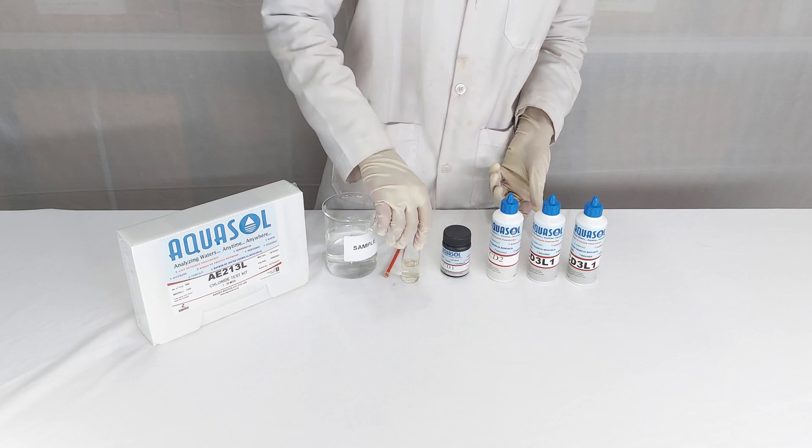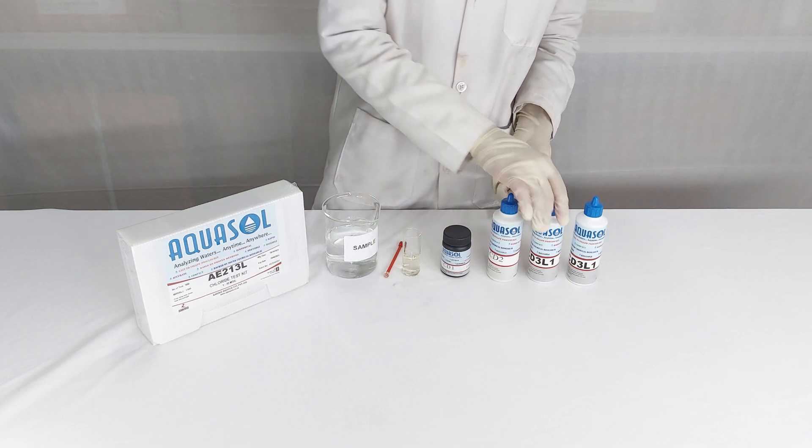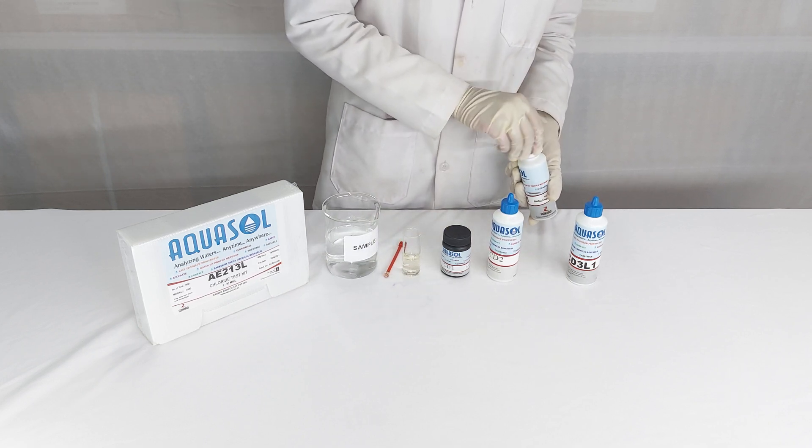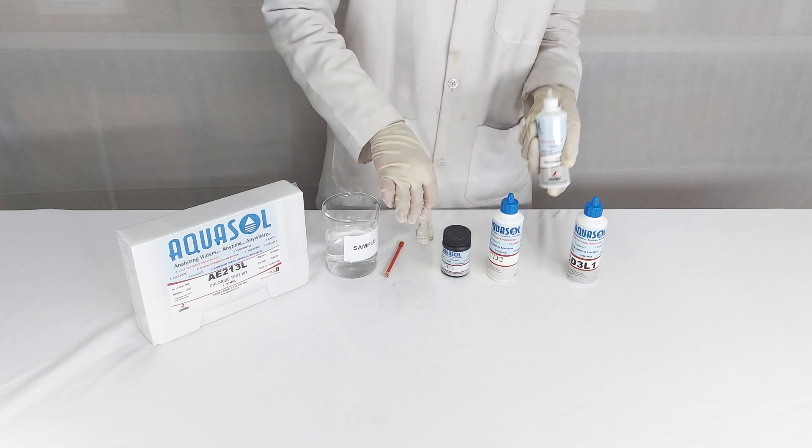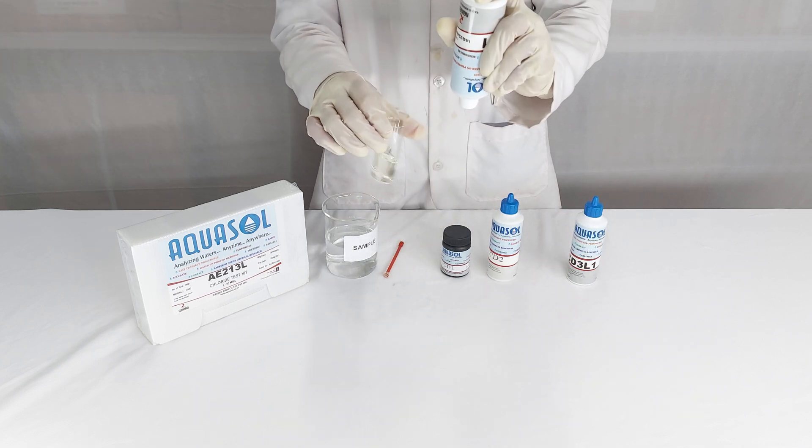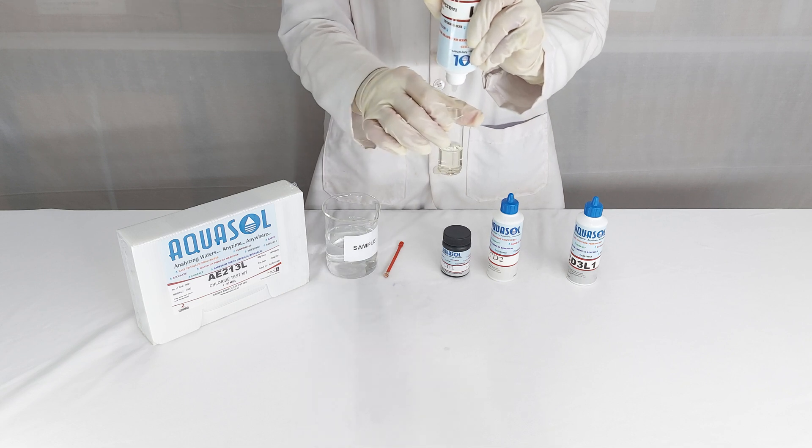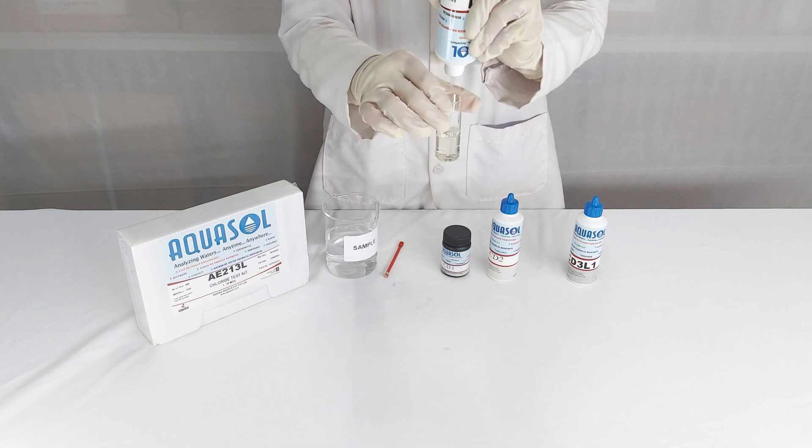To estimate the value of chloride, we will add CD3L1 reagent dropwise. Count the number of drops while mixing until the color changes from yellow to violet.